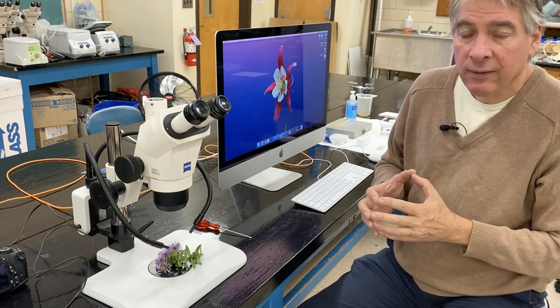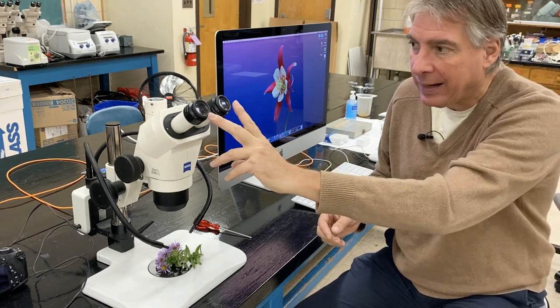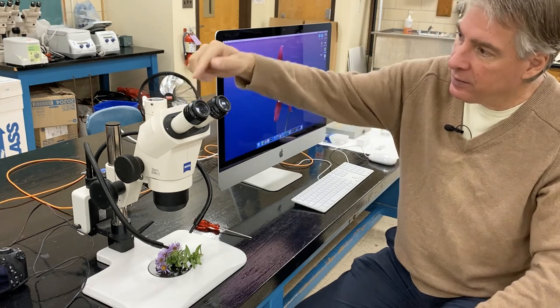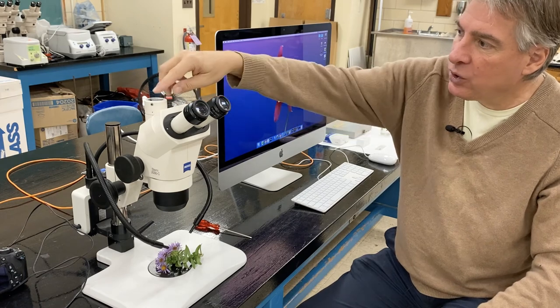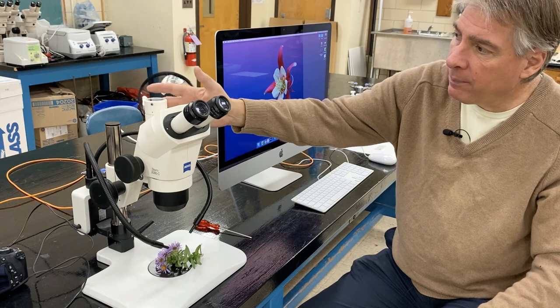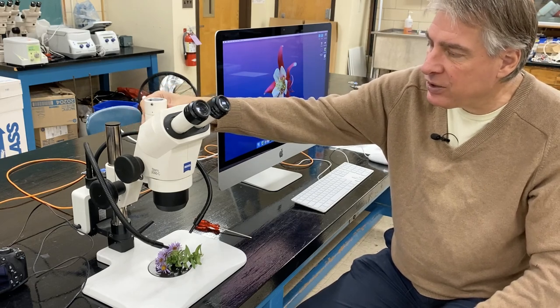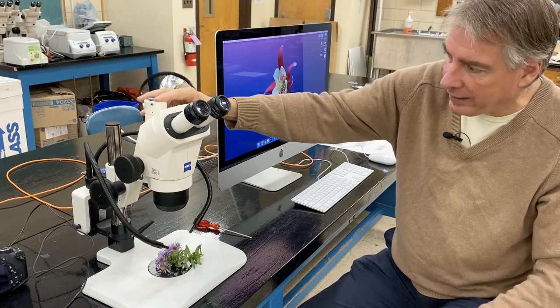In some circumstances they break the light up three ways. There are binocular eyepieces, and then the third port for the camera is called the trinoc port. So binocular is for two, monocular if it were just one, and trinocular if it's three. This microscope breaks the light down into right and left eye, and there's a lever in the back that takes light from one of the eyepieces and sends it to the camera. This is called a trinoc port.